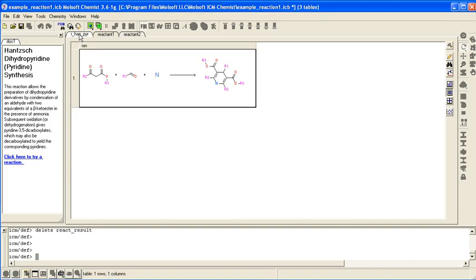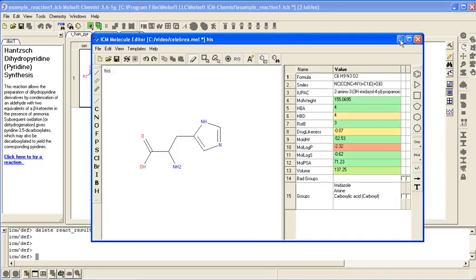In this example we show how to make a database by reaction. Here we have sketched a reaction in the molecular editor.